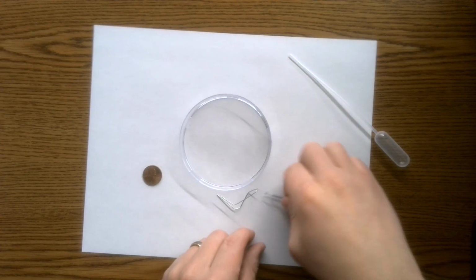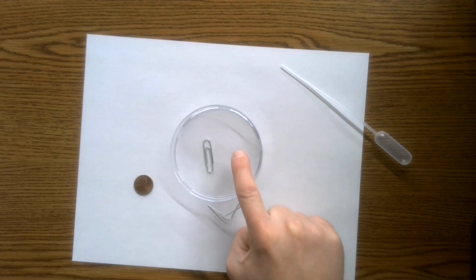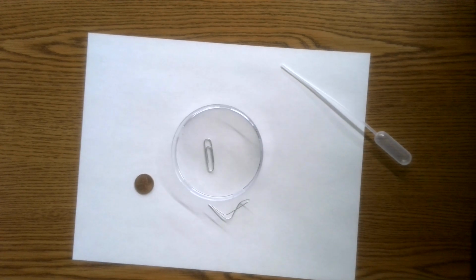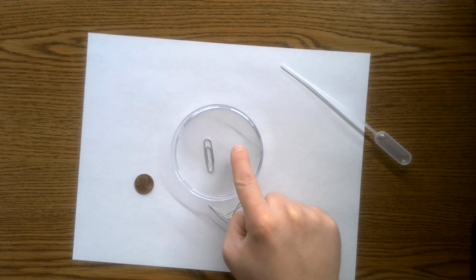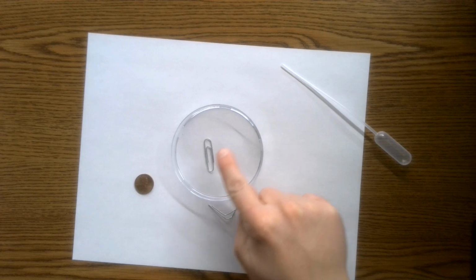And then when this is floating around on the top of the petri dish, you're going to put your soap on the side, not on top of the paper clip, but on the side of it, and you're going to see what happens. Okay? And what should happen is the hydrogen bonds are broken, and then this paper clip should fall down to the bottom.